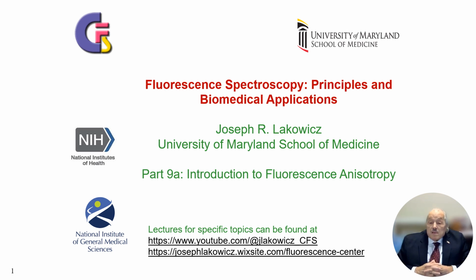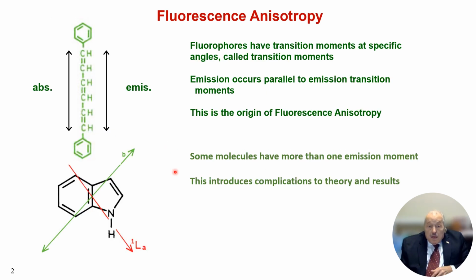Today we're going to start talking about anisotropy. Actually, I like anisotropy because it can all be explained by chemical and physical principles. So let's start off by showing you what anisotropy is.